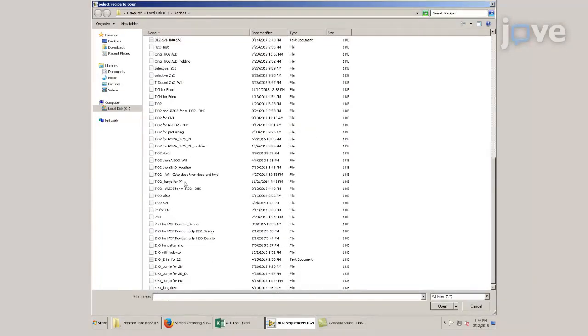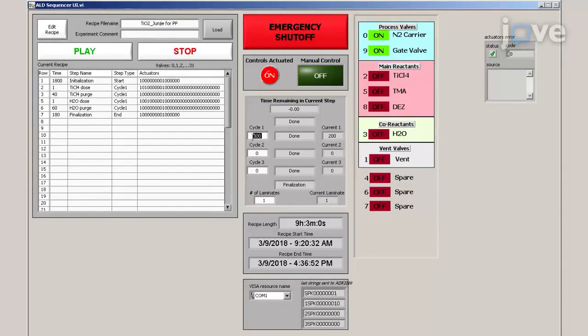Load the recipe for titanium oxide on fabrics. Set the recipe to run 300 cycles.